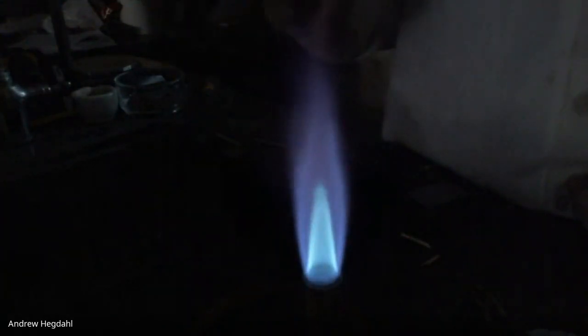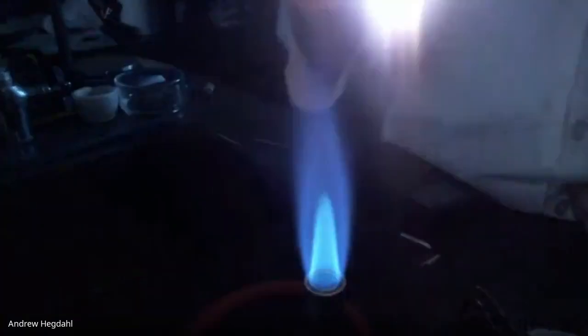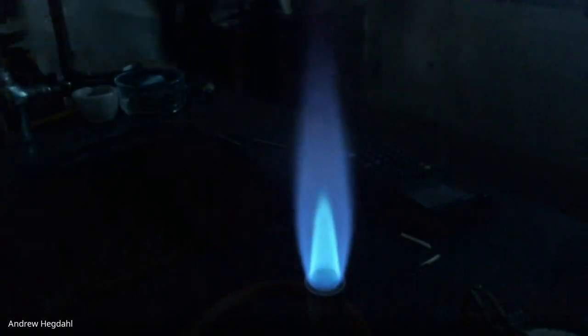If you do this and you notice that the flame stays, I guess I can't get mine to do that. Sometimes some of the salt crystals fall off your wood splint, and they stay on the rim of the burner, and your flame would stay green like this. If that happens, use your wood splint to scrape out or pop out that piece of the salt crystal.